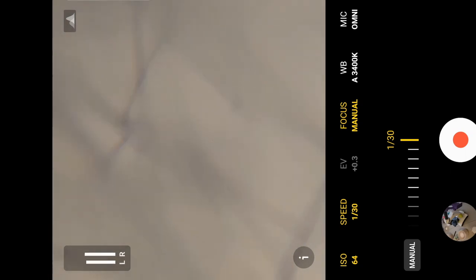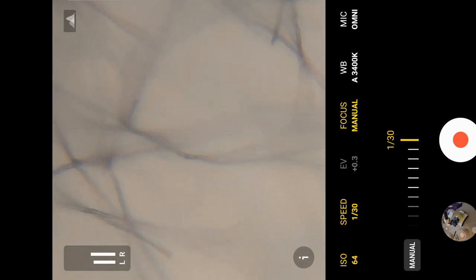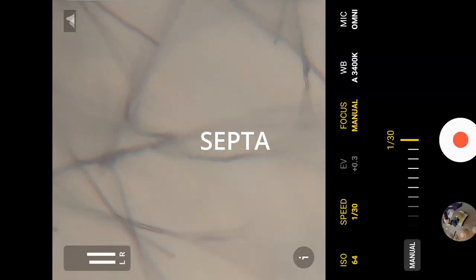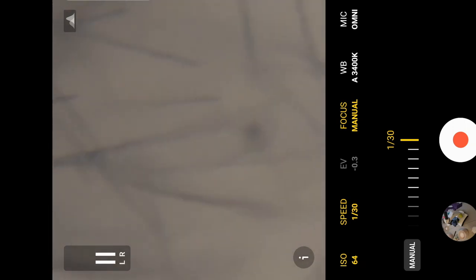So I'm going to adjust the shutter speed a little bit to brighten it up. This will make it a little blurrier though. Alright, from what I can tell, that looks like a connection between cells. And I don't see a clamp connection on it. So I'm going to lean towards this is probably a mono, but I'm going to continue looking and probably find maybe five or ten more connections like that. And if all of them appear to be lacking a clamp connection, then I can be pretty certain that this is a monocaryon. There's something that kind of looks like it could be a clamp connection right there in the middle. So I'm going to keep looking around.